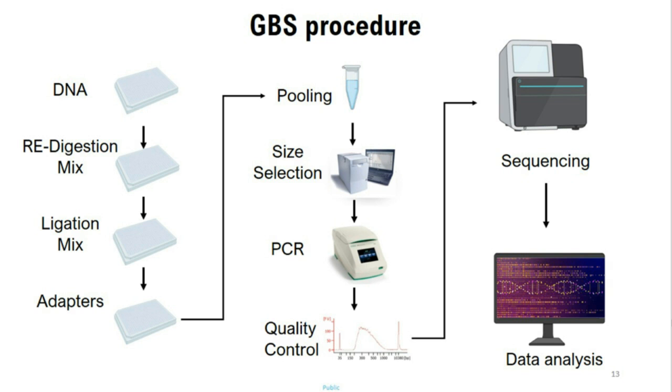After sequencing, we have the data analysis, and data derived from the GBS protocol has been used for different types of studies in genetic experiments, like genome-wide association analysis, QTL mapping, genetic diversity analysis, and also for breeding purposes like genomic selection.